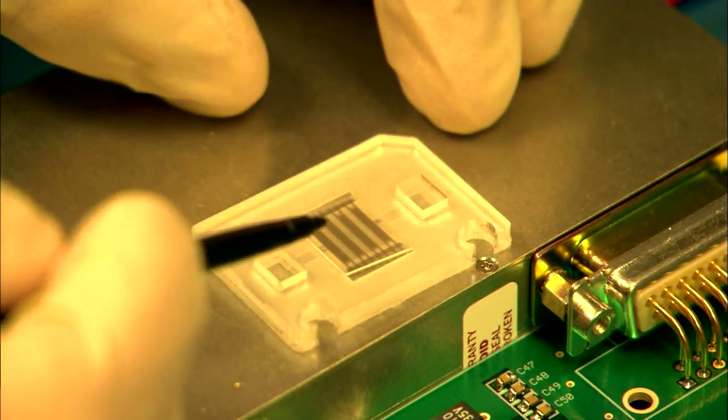To build the computer codes takes a lot of time and effort, but once we did that, we were able to capture most of the physical effects of generating the surface acoustic wave, and it turns out that allowed us to transfer that technology to other acoustic projects at Sandia.